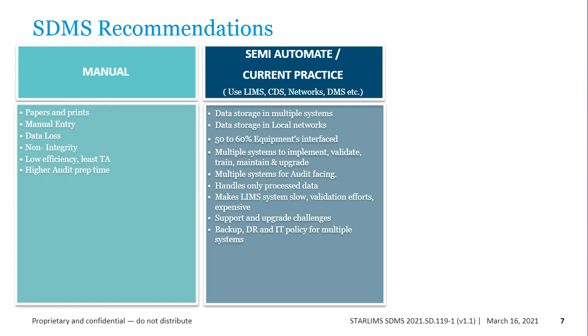And you also have multiple systems for audit facing, and some of the deep problems are that these systems are meant for taking only the process data or the files that are generated at the end of the runs. So what happens to other data, such as the raw data, the audit trails produced by equipment, the run reports and intermediate reports produced by the equipment? They are just left behind in those native systems and then taken as an IT backup, but they have never been handled as one single practice.